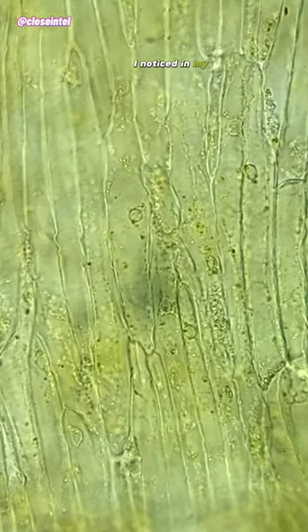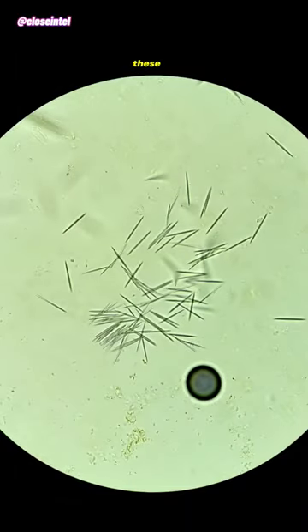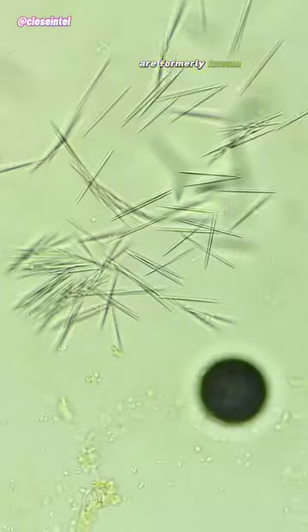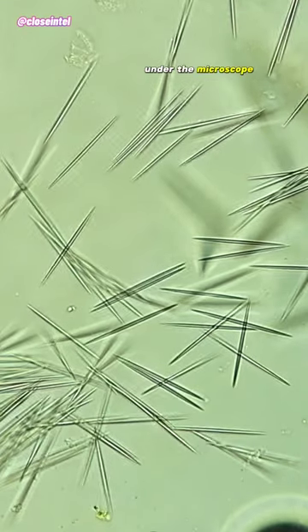When zooming in to 400 and 600 times magnification, you can start to see some of the nuclei inside the cells. I noticed in my pineapple juice versus germs video that some of you pointed out that pineapples contain microscopic needles. These tiny needles you're thinking of are formerly known as raphides, and I also found some of these when looking at kiwi under the microscope.